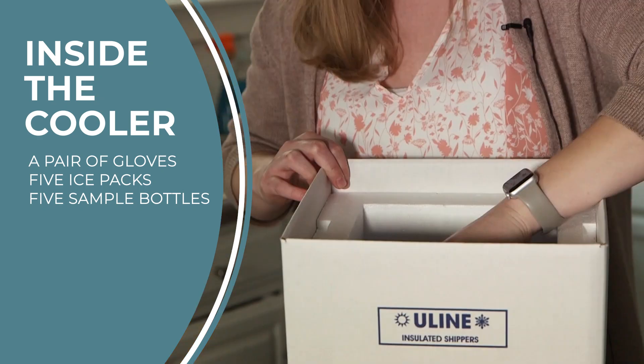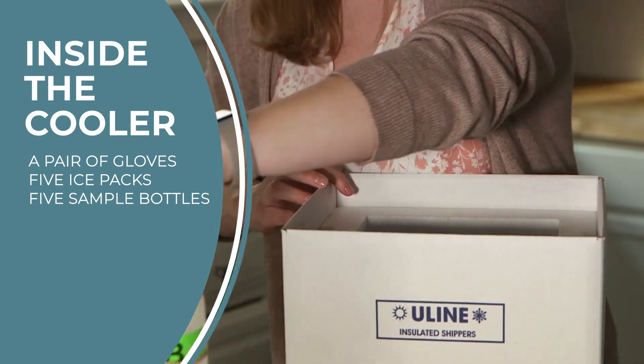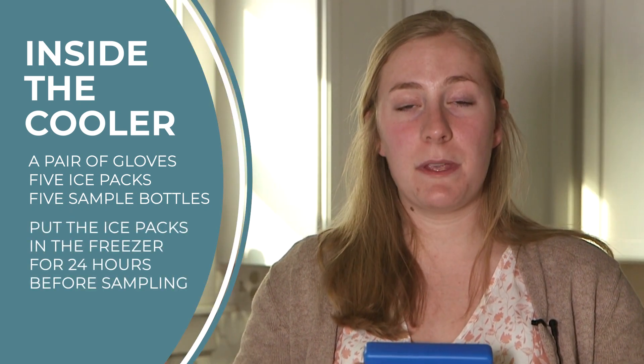Two of these bottles are labeled A and B — set these aside for now. Grab your five ice packs and put them in the freezer. They need to be in the freezer for at least 24 hours before you can begin sampling.